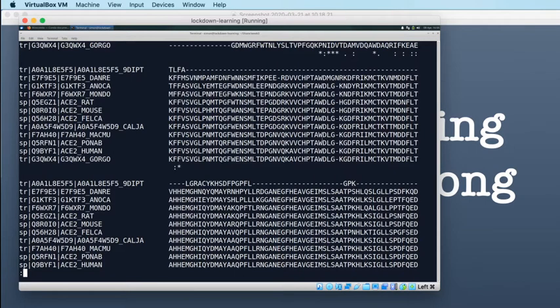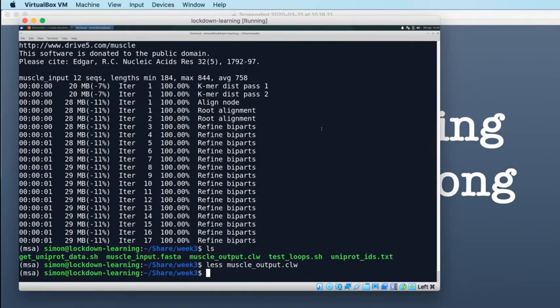Okay, so we have got to the point where we've written really quite a complicated script now to do some really genuinely proper bioinformatics. This is exactly the kind of script that I may well write from time to time to download some data and generate multiple sequence alignment from it. So we've done some real bioinformatics work, which is great. We're only just over 2 weeks in, if you think about it. Doing an hour a day, I think we've done really, really well to get this far and to produce this kind of script in that short time.